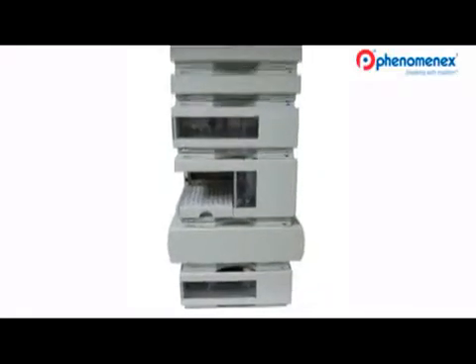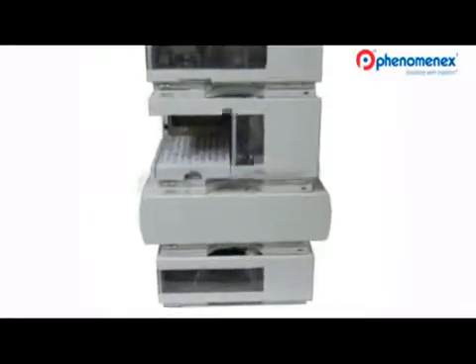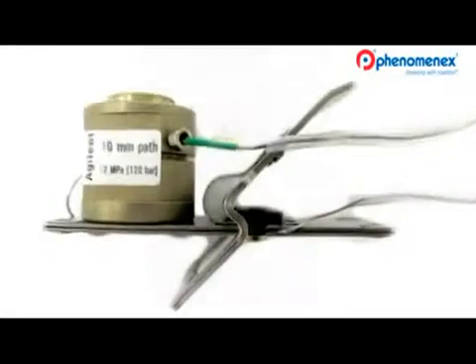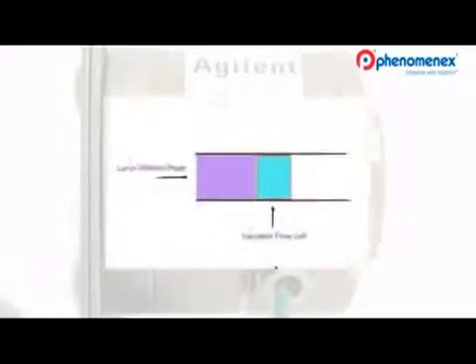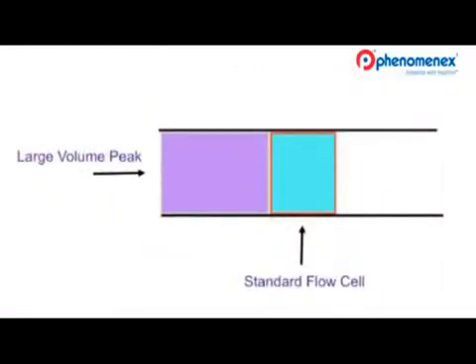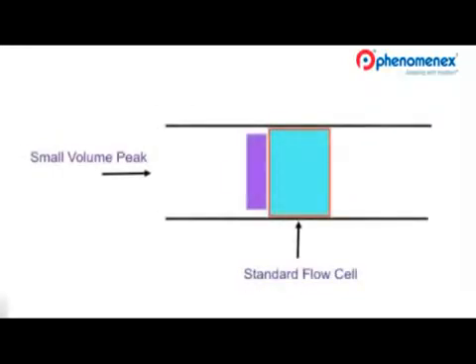Now let's look at reducing more sources of post-column peak dispersion, specifically that which takes place in the flow cell. Using Kinetics core shell columns, a peak's volume will be very small — large flow cells will disperse narrow peaks and reduce the apparent efficiency of the column. As a wide sample peak from a column moves through a large flow cell, the volumes are nearly matched and larger volume peaks don't appear to disperse. However, the high-efficiency, low-volume peak from Kinetics can be dispersed in a large volume flow cell.